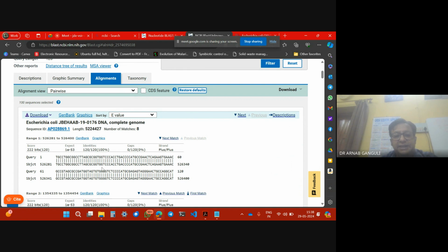टी टी जी जी, अगर इसमें एक न्यूक्लियोटाइड डिफरेंस है तो यहाँ पे एक ब्लैंक आ जाएगा. तुरंत you will get to know that there is an error over here. एरर नहीं, there is a gap over here, there is a mismatch. The word is mismatch. And your statistical score थोड़ा सा कम हो जाएगा, it will become less, a bit less. That is the beauty of this system.